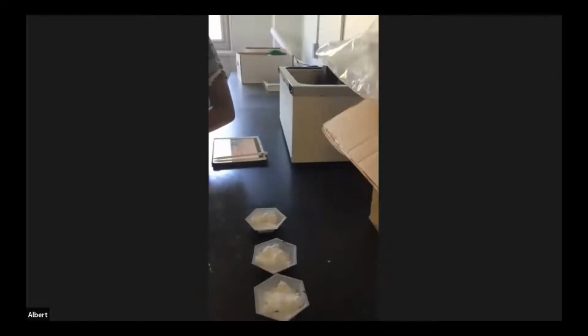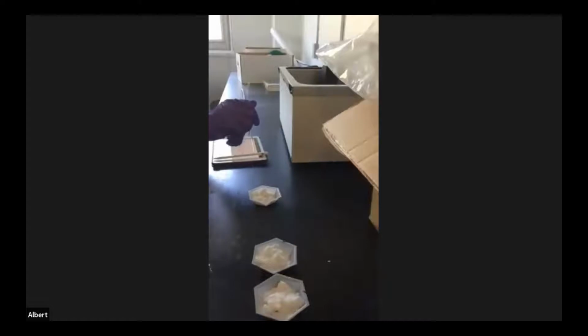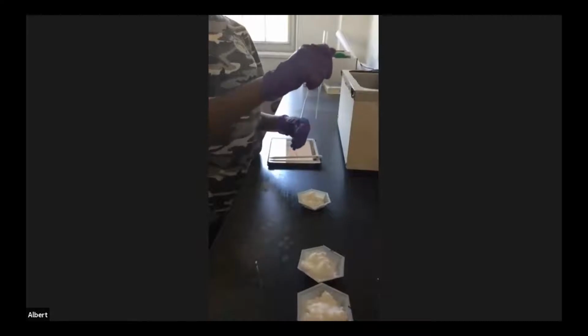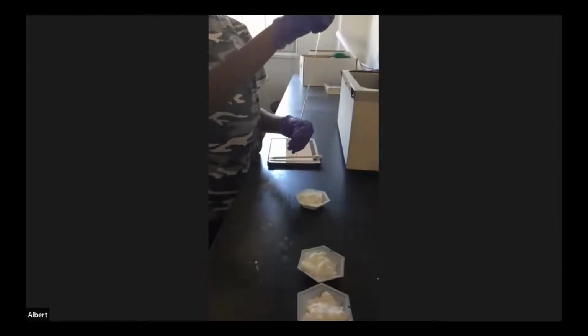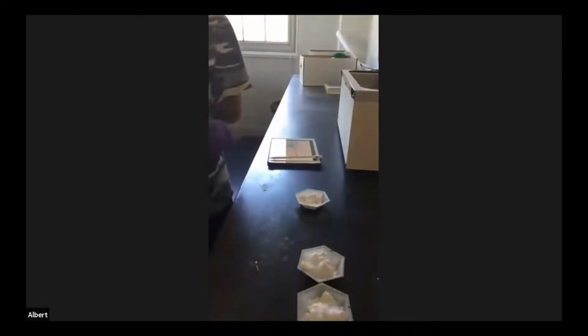I'll give you this NMR tube right here, and then a pipette. So you're going to be doing sample 1. So just dip the pipette down into that sample. No, you gotta dip it. You stirring? You think you making ramen noodles, chicken flavor, beef flavor. More, get a little more in there. All right, yeah, perfect. Now just sit that down in a tube like that. And we need to mark that.